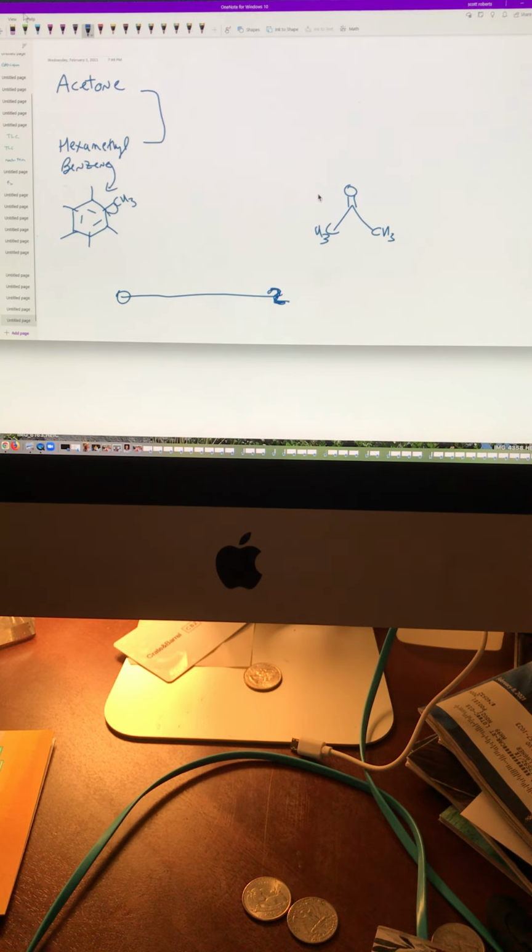What's next door? There's no trick. How many hydrogens next door? 0. All right. What do you get for hexamethylbenzene between 0 and 2? You get a singlet. How tall is your singlet?